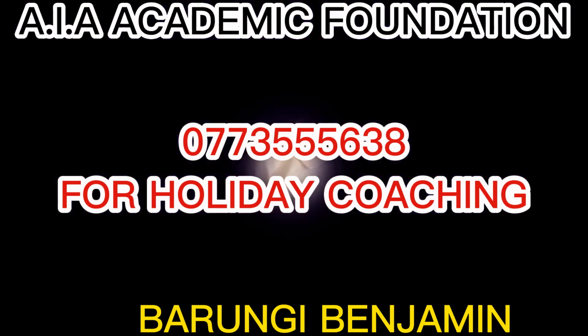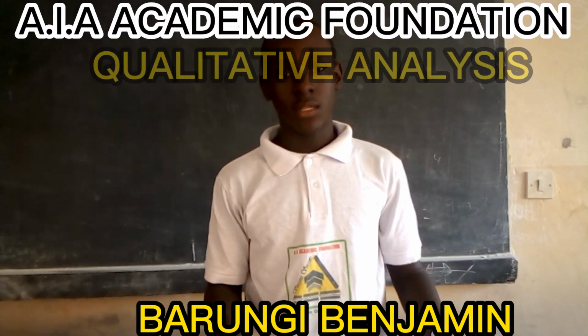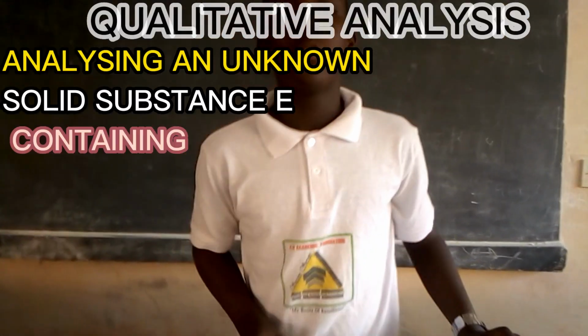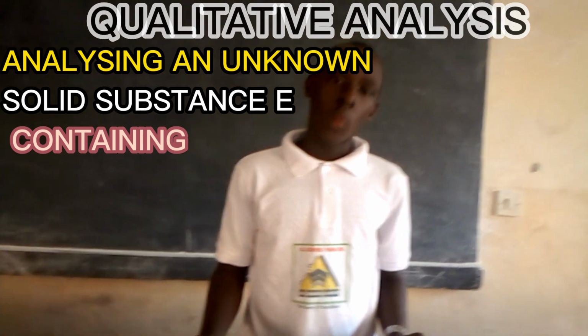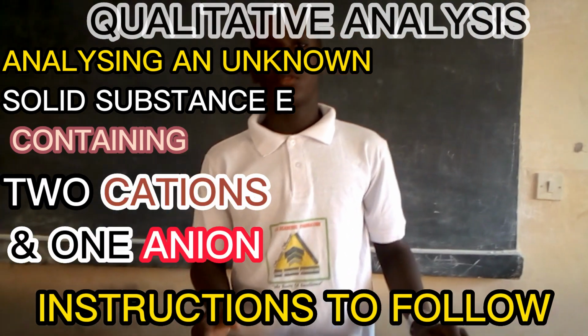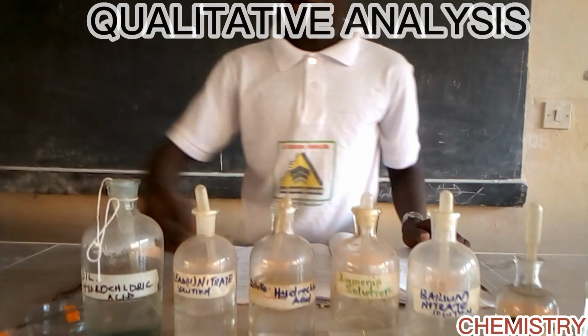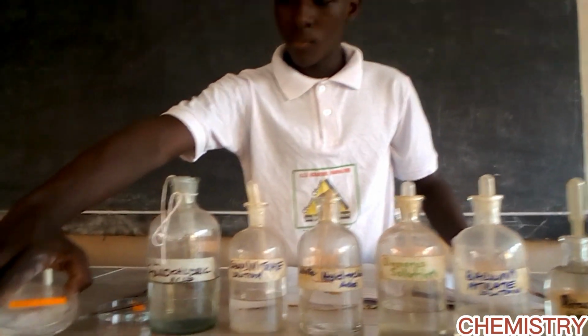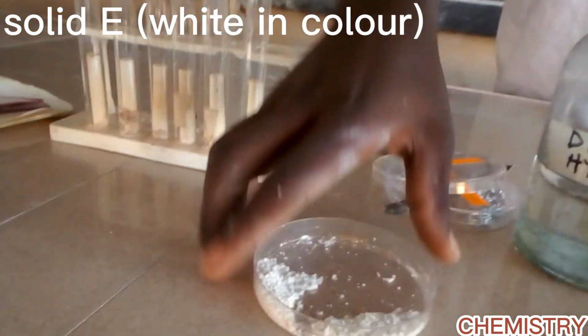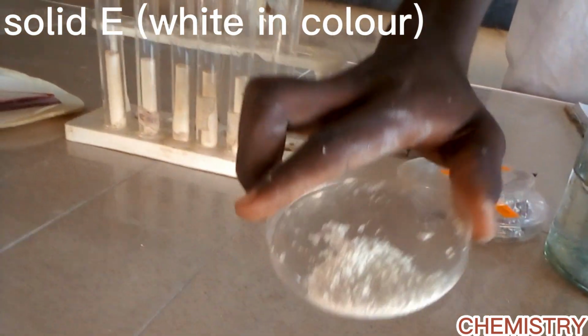I'm here to take you through qualitative analysis, and we are going to test for 2 cations and 1 anion. We have been given a set of instructions to follow, and we have been given solid E, which is here. As you can see, this is solid E, it's white in color.